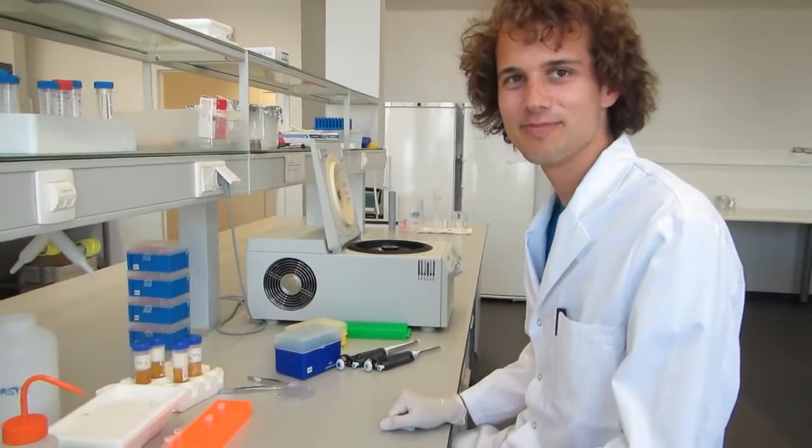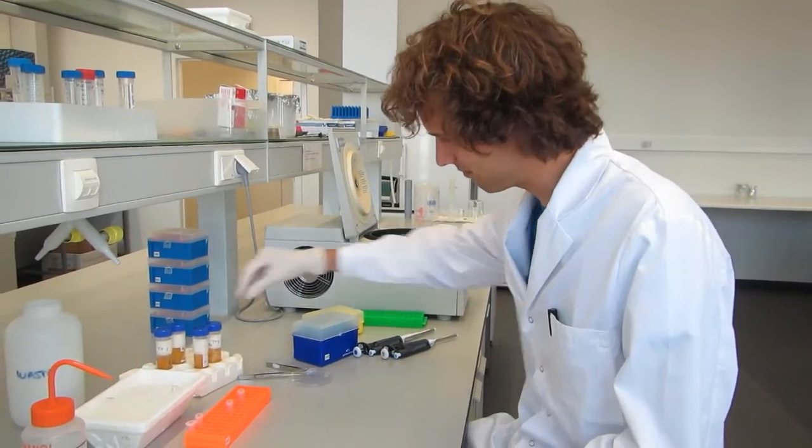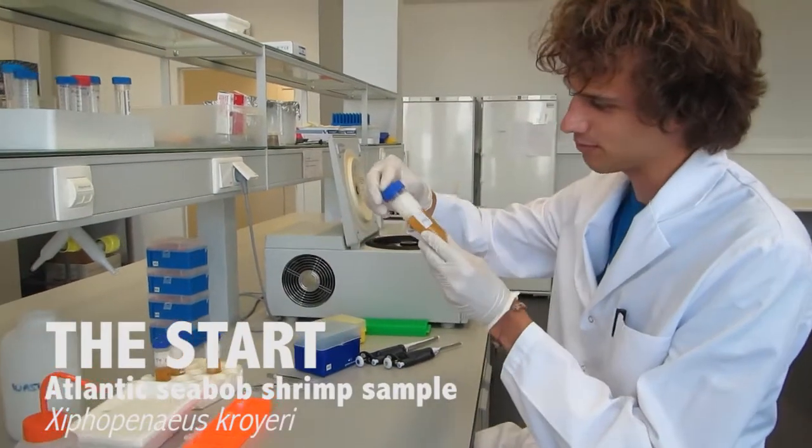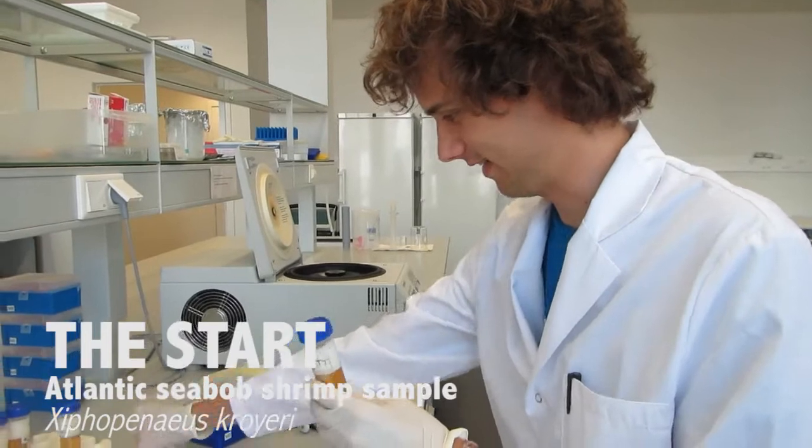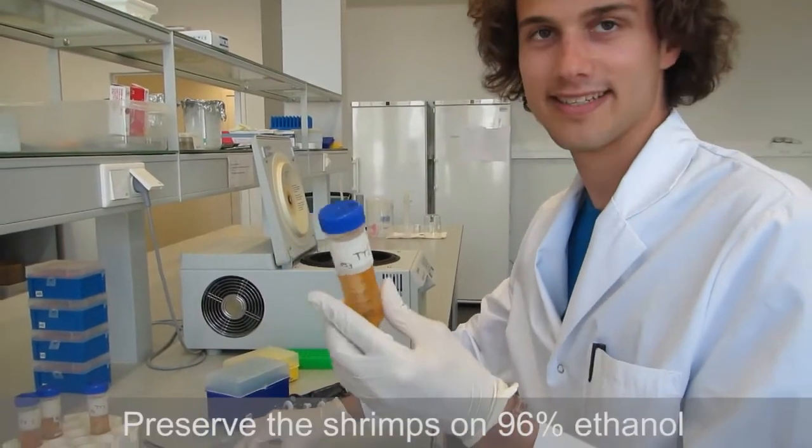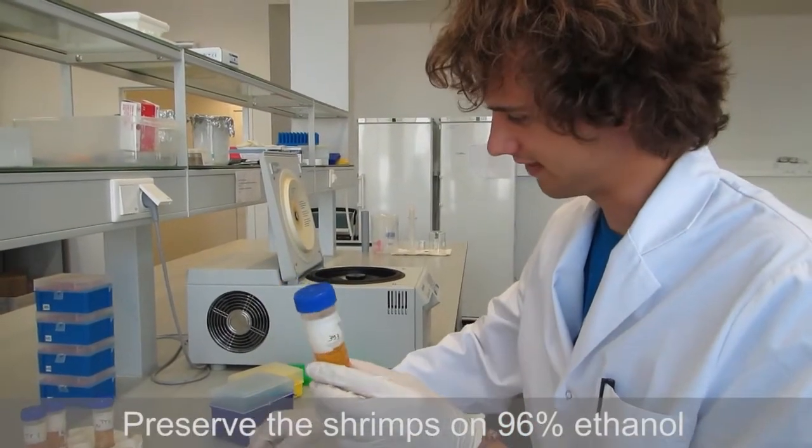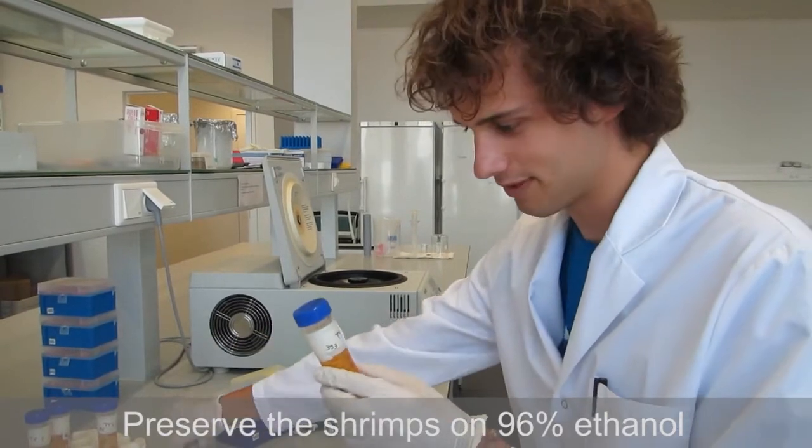Today we will extract some DNA from the seabob shrimp. Here we have some seabob shrimp in ethanol. It's 96% ethanol, so that's good for preserving the DNA of the shrimp.